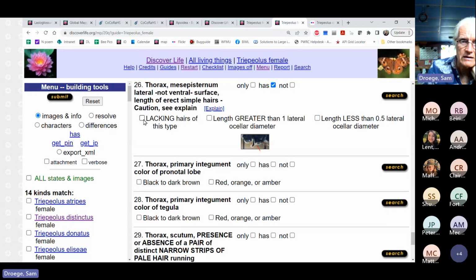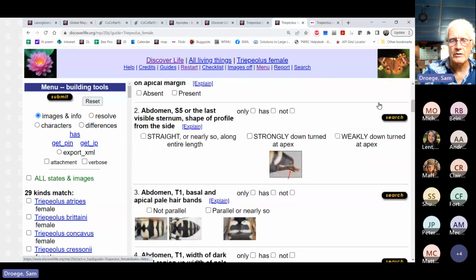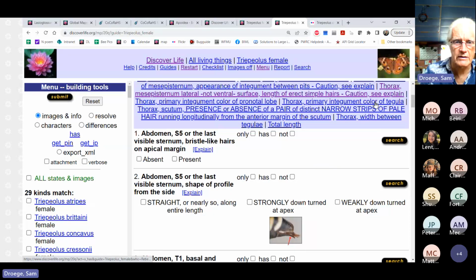If we go to lacking, you'll see many more species are scored. So 21 out of, what is it? Again, 29 species, I think. Oops, to get rid of that. Her trick with HAS, 29 total, is you can't leave any hanging check marks or it will do something not what you think of it as. So let's go maybe to the top of the HAS menu, and we'll look at some other kinds of characters and then try and see maybe under the microscope some examples.